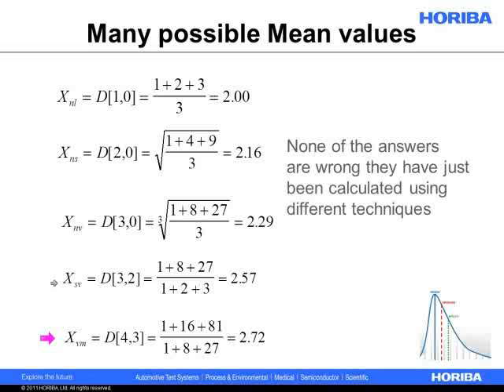For instance, the D32 here, which is also known as the Sauter mean diameter, SMD, is used for different technologies. It's used to give you different information. Now the reason laser diffraction uses the D43, the volume-based mean by default, is because by default laser diffraction is a volume-based technique. All of the results are being reported on a volume basis.